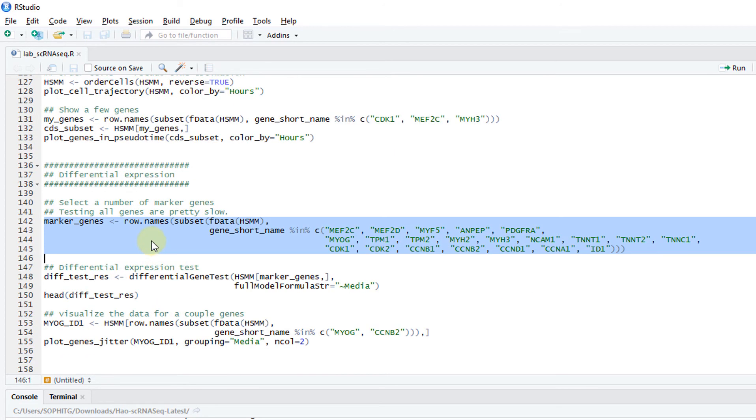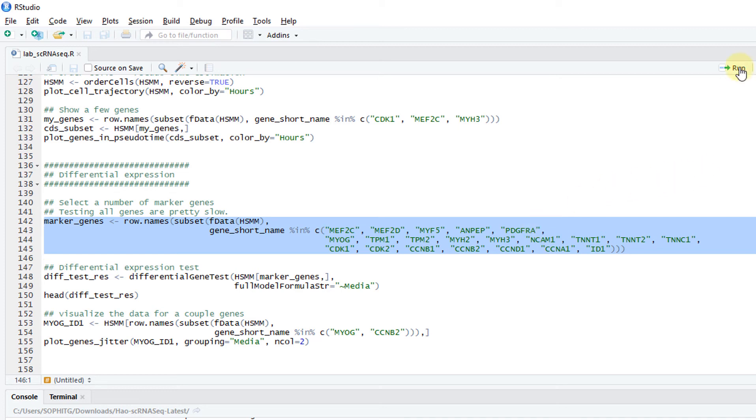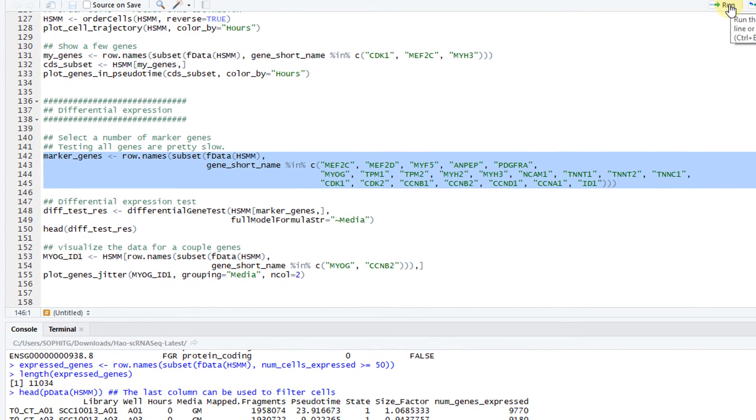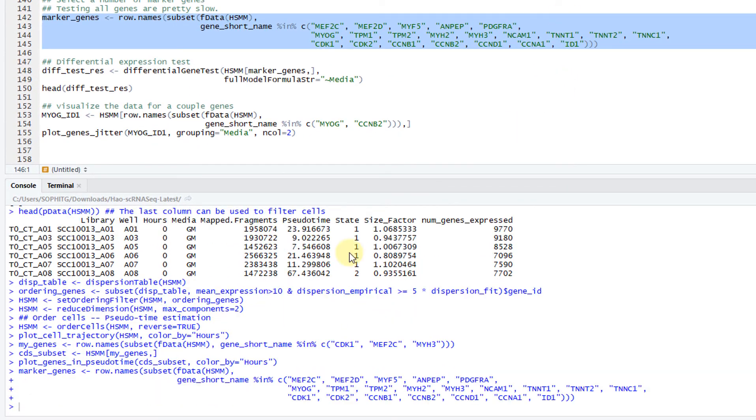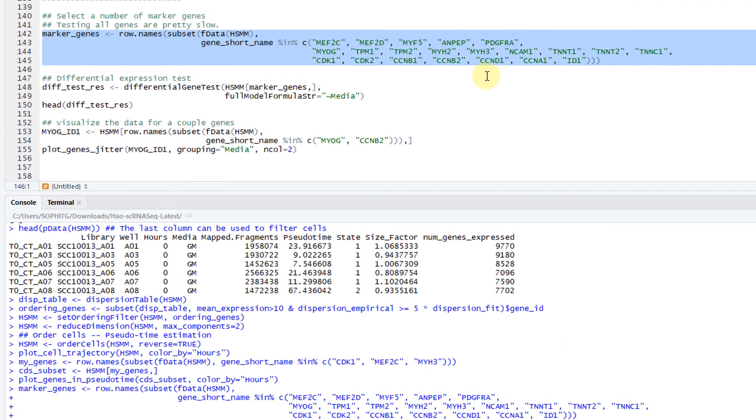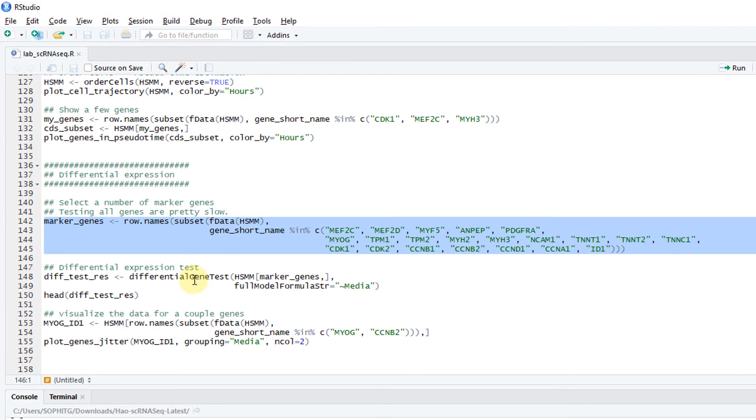You can also do differential expression in Monocle. Monocle uses a GAM model, a general additive model. Here I'm selecting a few genes to do differential expression. Because the DE test in Monocle is very slow for whatever reason.